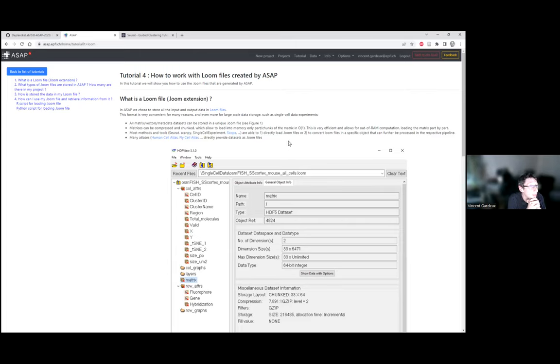But I would recommend, if you have some that are not present and you think they would be important because you are an expert in the field, to tell us, because of course we don't know everything. In the lab, mainly, we work with model organisms. We also work with mosquito, but mosquito is very similar to Drosophila, so we can use the Drosophila ontology for mosquitoes. It works pretty well.